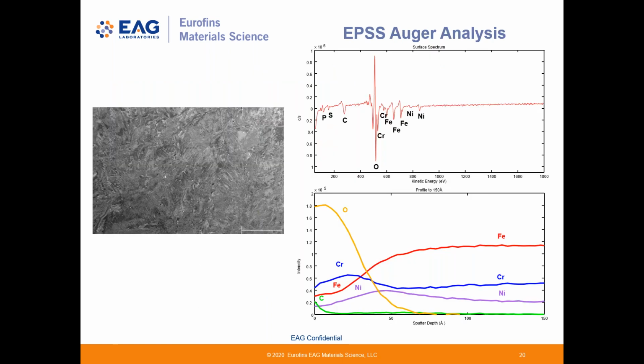Okay, so how we determine thickness of these profiles is we measure the sputter time here in this axis, and we convert this to thickness by, under the same conditions, measuring a silicon dioxide standard of known thickness. So we get a sputter rate in terms of SiO2 thickness, and then we convert this scale to that same depth scale.